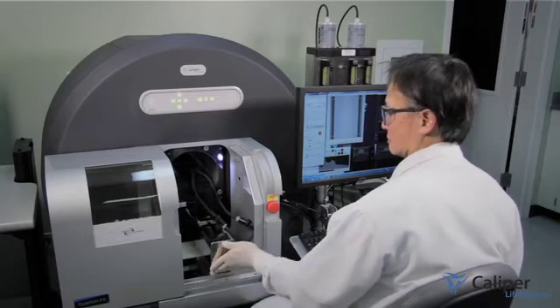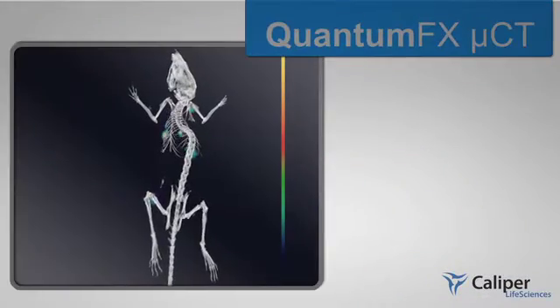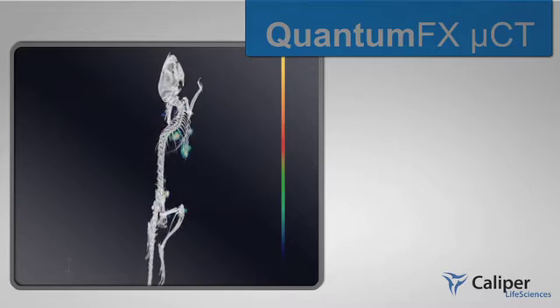With the QuantumFX, you can monitor and characterize disease progression throughout your complete study using microCT without impacting the underlying biology.